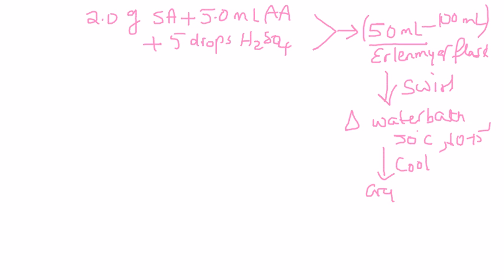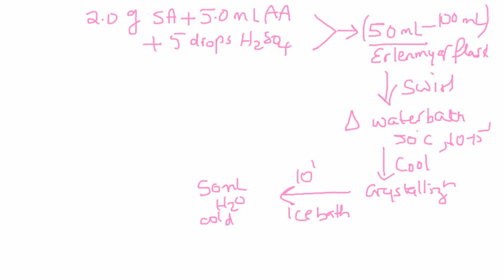When you cool, crystallization should occur. And then you cool it for another 10 minutes in the ice bath. And then you will add 50 milliliters of cold water.